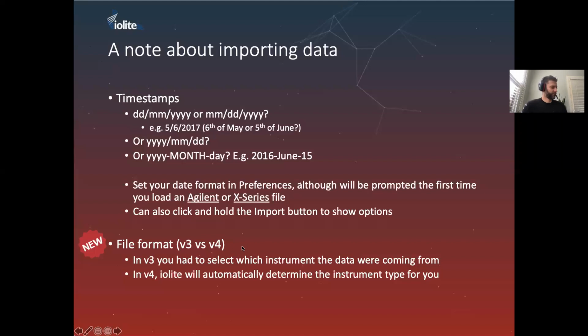Just one thing to note for people coming from version 3 to version 4. In version 3, you had to tell iolite what the instrument was that you were importing from. In iolite 4, it'll automatically determine which instrument it is.